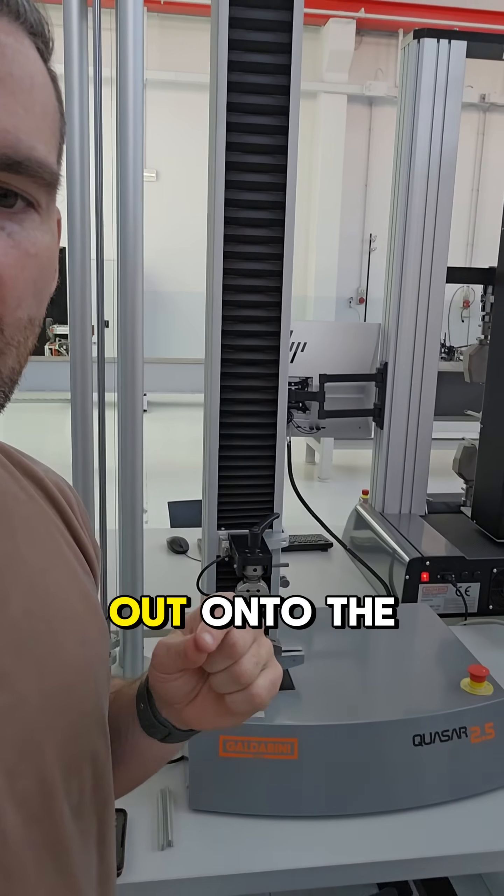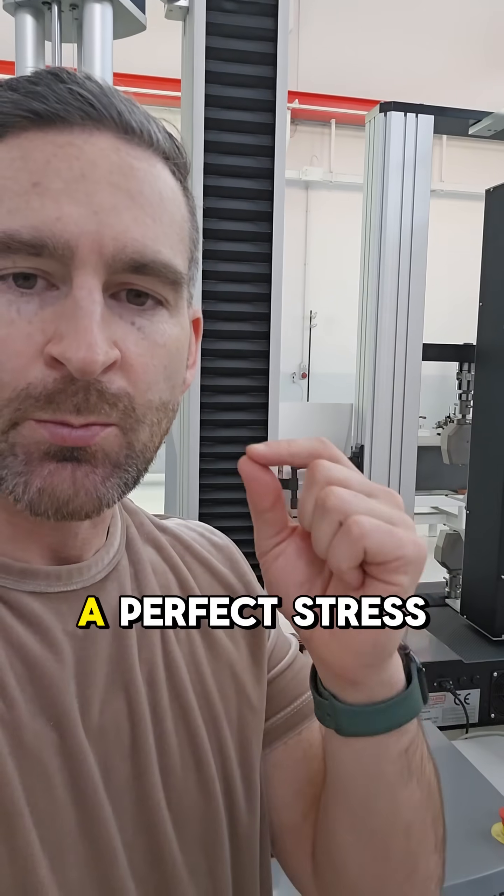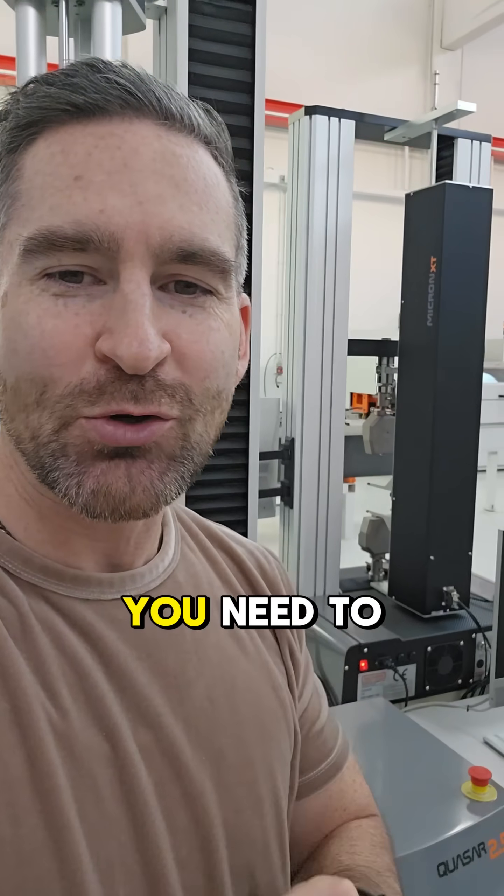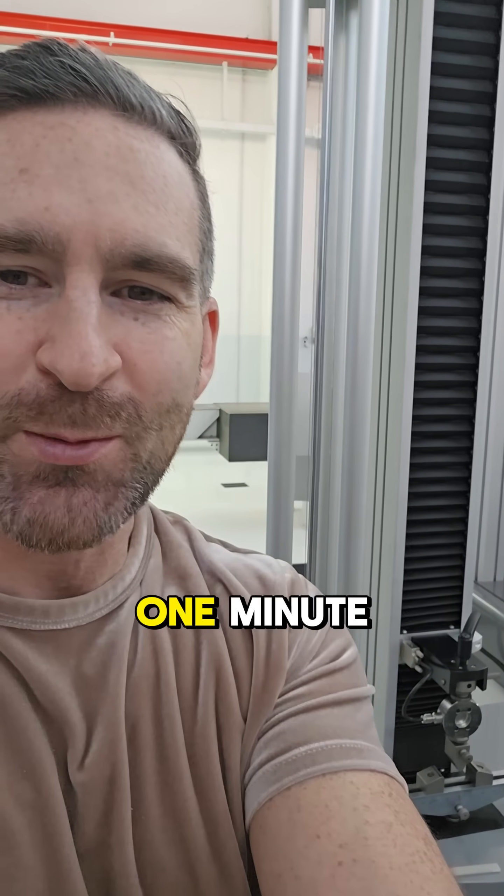All of that data will read out onto the computer and give us a perfect stress-strain curve for further analysis. So that's everything you need to know about ASTM D790 in less than one minute.